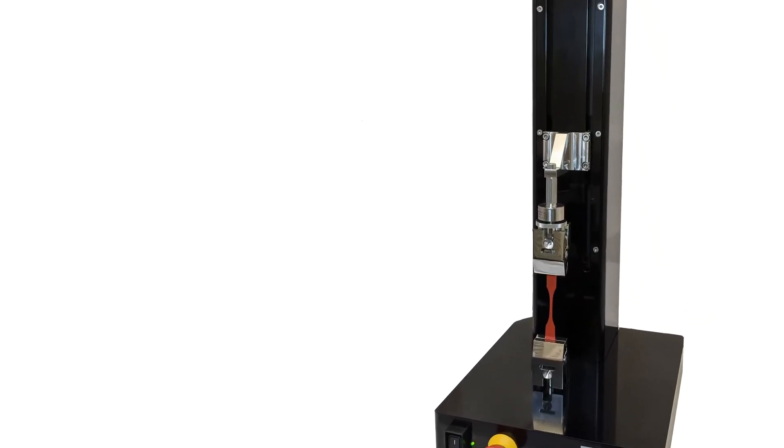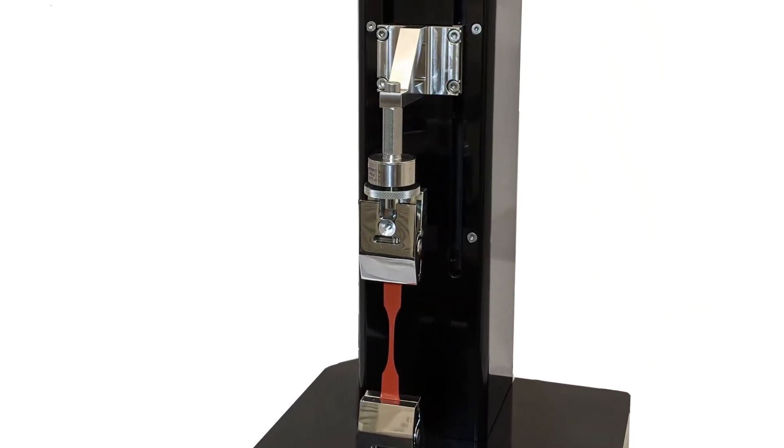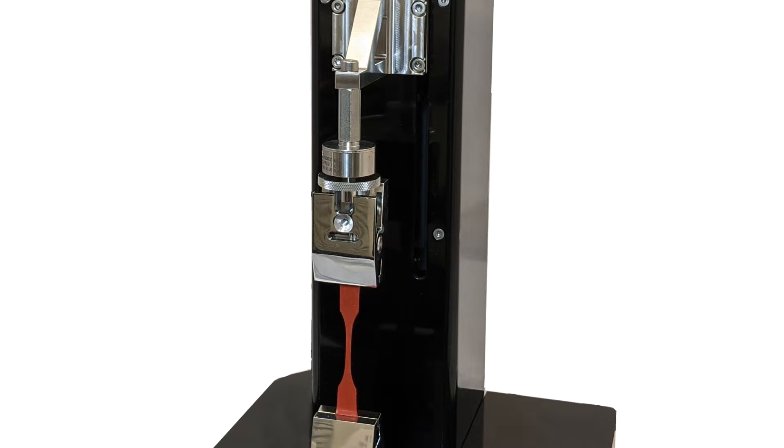Let's first take a look at the most common type of test, a vertical tension test. On the upper side, we have the load cell mounted to the crosshead with a grip.